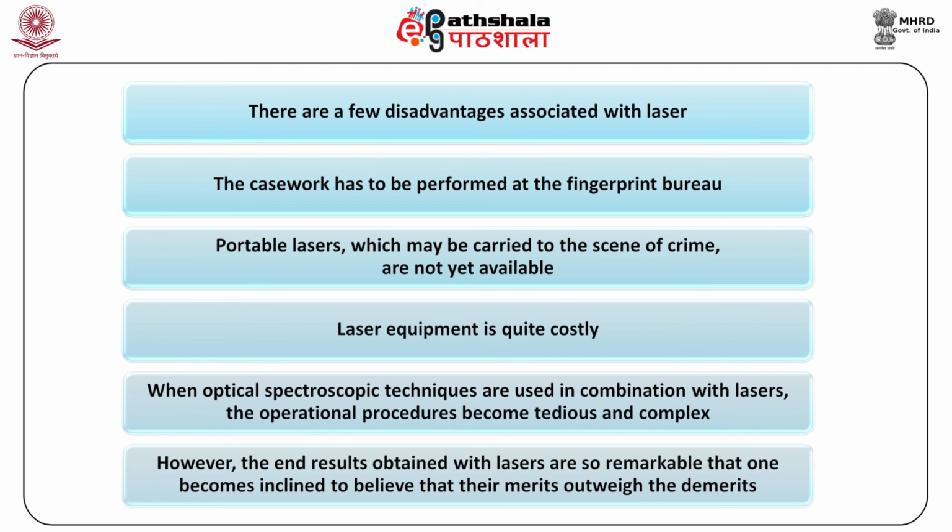When optical spectroscopic techniques are used in combination with lasers, the operational procedures become tedious and complex. And lastly, we have learned that however, the end results obtained with lasers are so remarkable that one becomes inclined to believe that their merits outweigh the demerits.